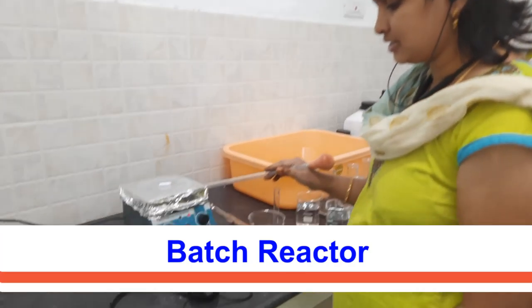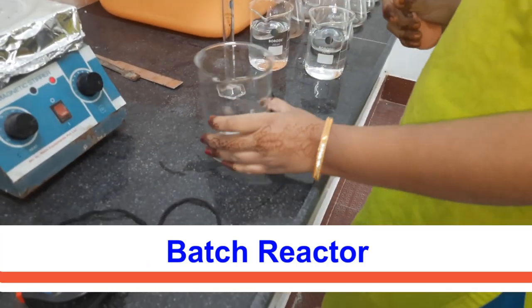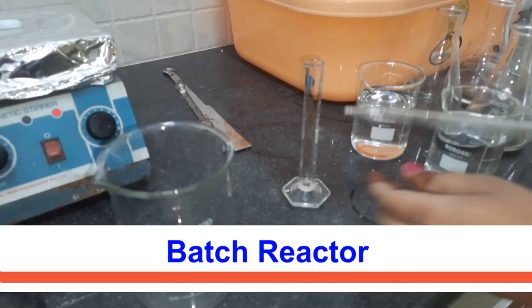Now, this is a magnetic stirrer. This is a stopwatch. And this is a pipette. This is a reactor for both the mixture, ethyl acetate and NaOH. Keep this one ready, a 10 ml measuring jar.